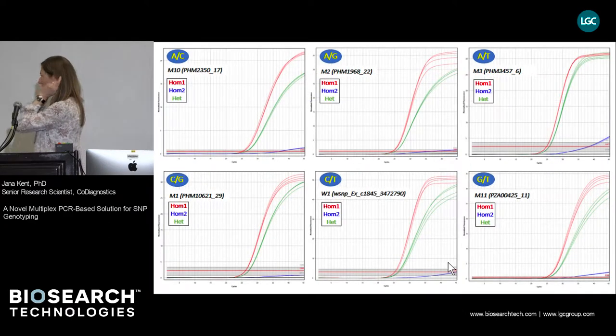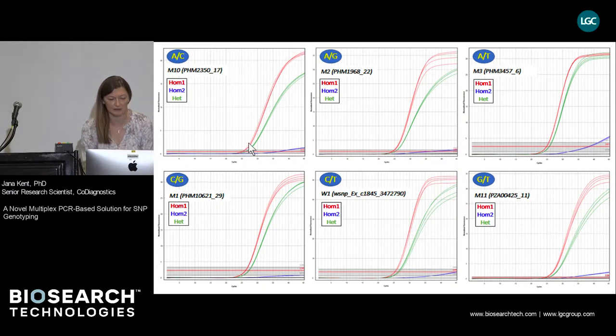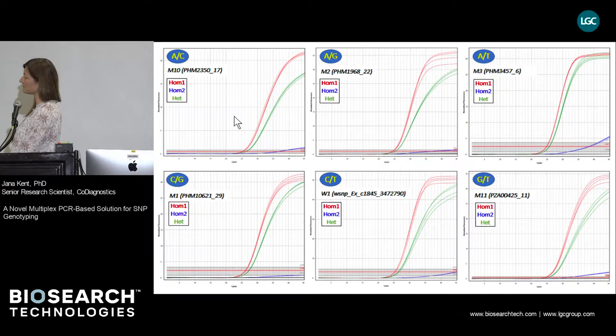First, we wanted to see the differentiation powers of co-primers for each possible SNP scenario — six possible DNA changes. This is shown in real-time PCR curves for each SNP scenario. Red traces show amplification of templates homozygous for the first allele; blue traces, which in some cases are almost completely flat, show amplification by the same co-primer of a template homozygous for the other allele; and green traces show amplification of a heterozygous template. The differentiation power is very good, as seen from the differential amplification of red versus blue traces.